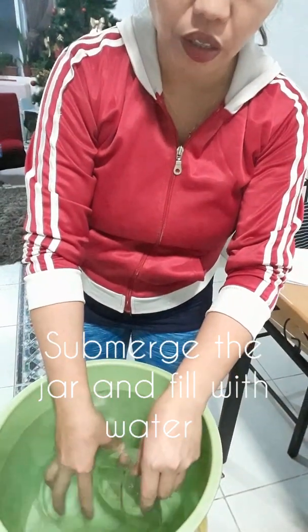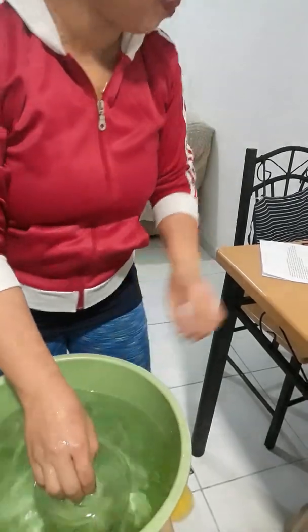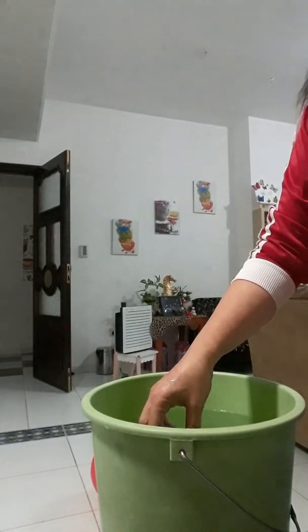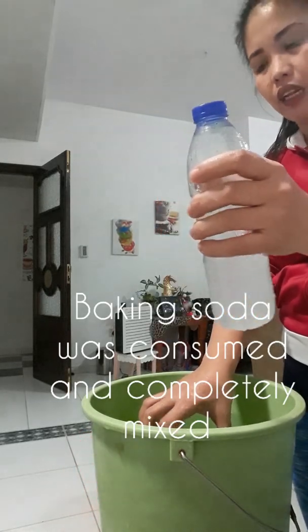Make sure no air is present inside the jar. There are no more bubbles, and there is no more baking soda present inside the bottle.